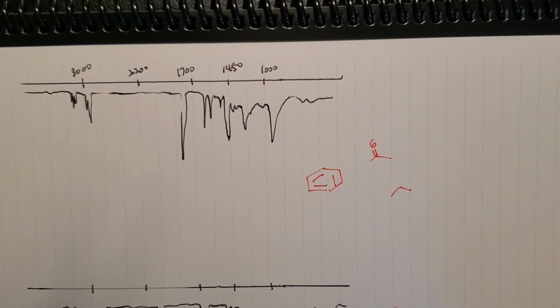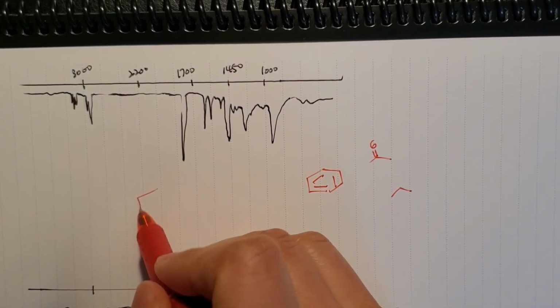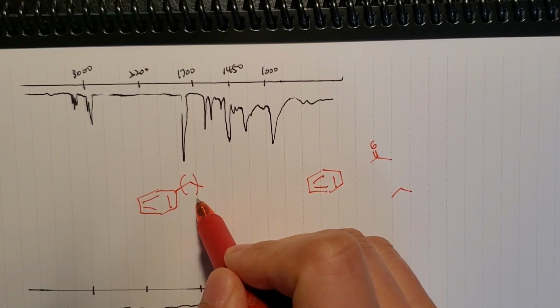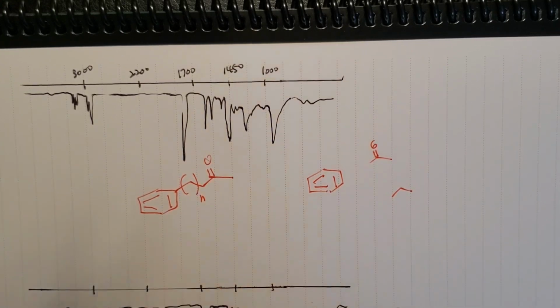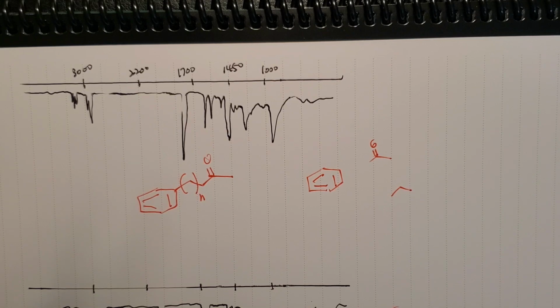In order to be typical, the resonance must be avoided. So you do this. You put, I don't know how many, depends on the formula they give you, but then this is bound to the carbonyl group, so you can avoid the resonance. So this is how you apply the variations, keeping it in mind, and then try to rationalize as much as you can for the given spectrum.